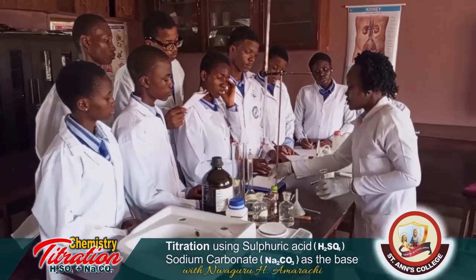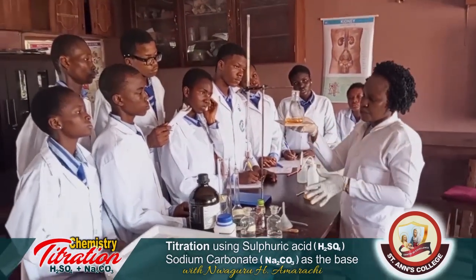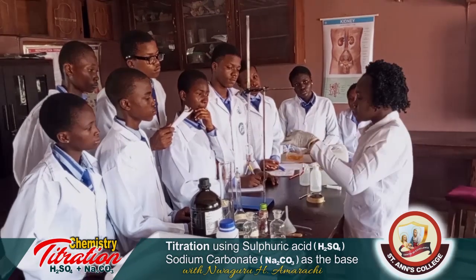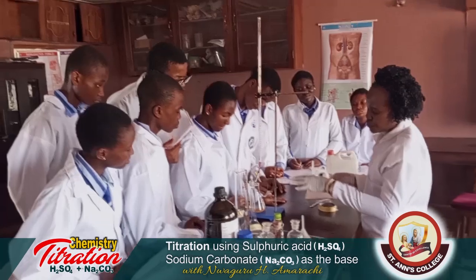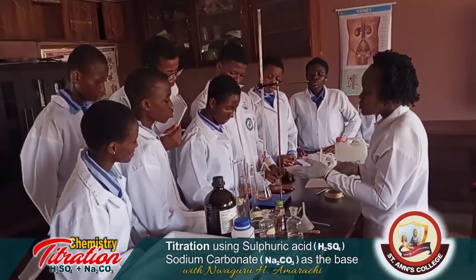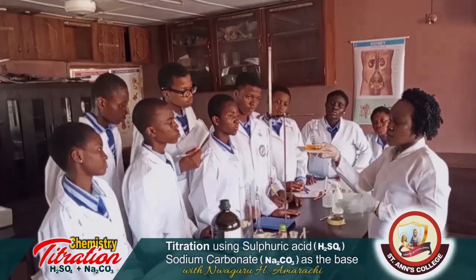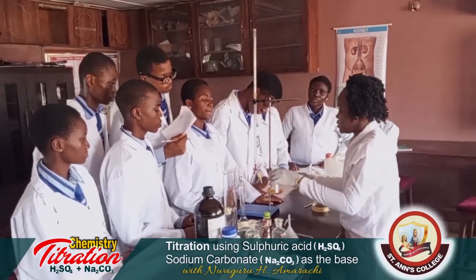Then another precaution is your white tile, to enable you to see a clear view of the neutralization. Because if you place it here now, there will be some color variations. So with the help of these white tiles, you have a clear view of what the endpoint will be.